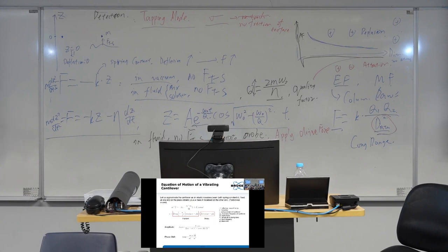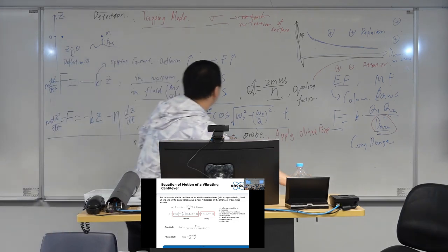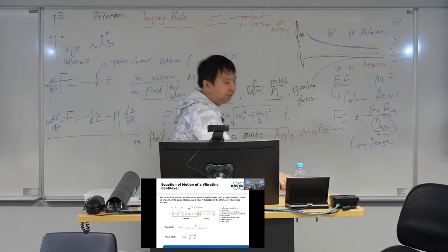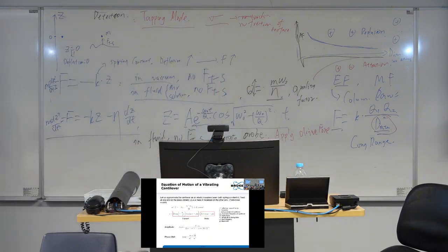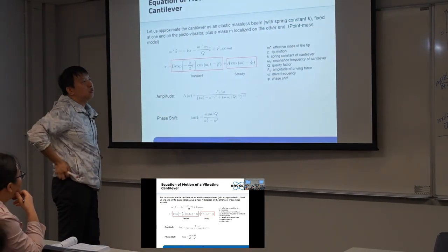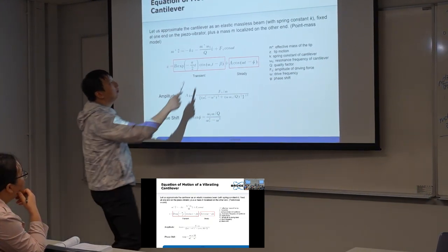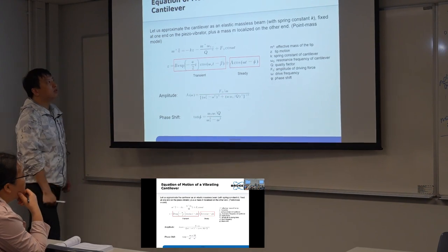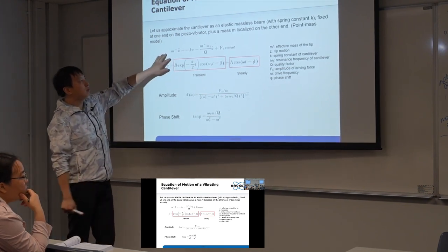It has the hydrodynamic force. And then we want it to do this tapping mode. We apply a drive force. That's all the three forces on these probes.